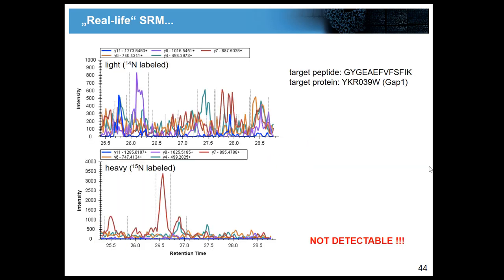And just to be complete, there are also examples where no matter what you do, you will just not be able to identify anything in your sample, okay? So that's also happening in SRM, and you must be able to detect this. And sometimes these are actually the most difficult cases to decide. Here, I cannot detect anything, or here I can detect something. Yeah, that's it.